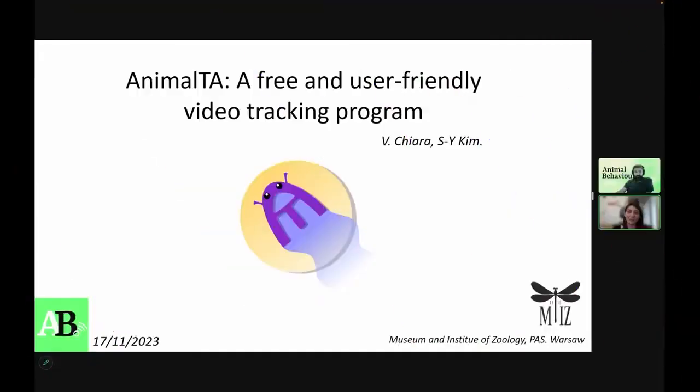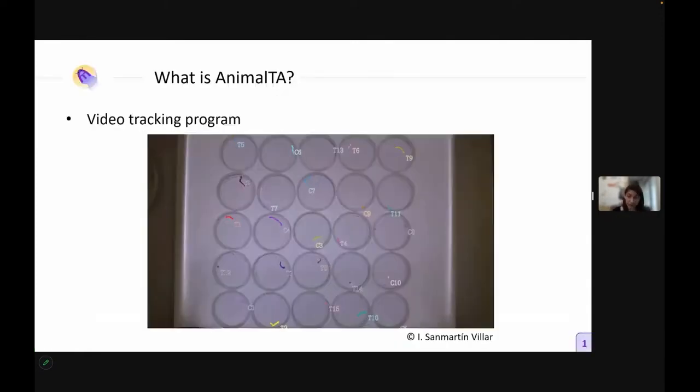Perfect. Thank you very much for this introduction. Thank you everyone for being here listening to me. So I won't wait any longer. So AnimalTA is a tracking software. I think there is no big surprise in that. But I'd like to present a bit more of what it is.